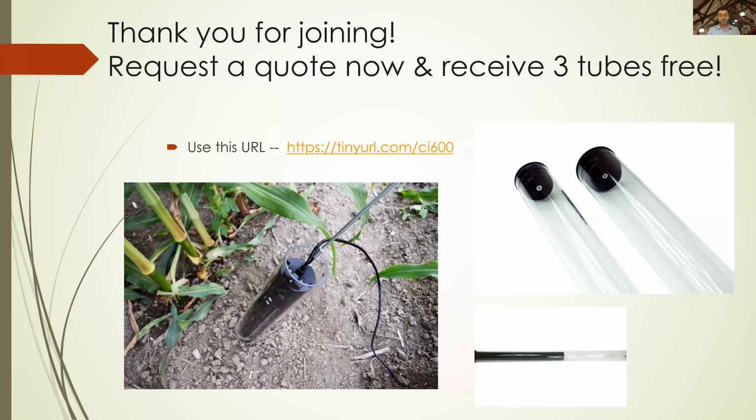Again, next question is, do we need to calibrate on various DPI? And the answer is yes. If you're changing the DPI, you do want to calibrate again. But it's just as simple as pulling it back out, knowing where you had the depth before just by using the lengths of the rod, putting it into the calibration tube, scanning, calibrating, and then pulling it out, putting it in for the resolution you're looking for.